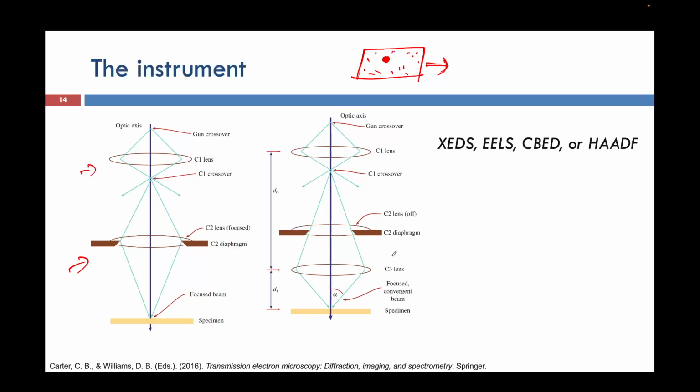And remember, here I have given one C3 lens. C3 means condenser 3 lens. It is not a condenser 3 lens, rather it is a combination, so this lens is called the CO lens. CO means condenser objective lens. In this scenario, the objective lens has been split into two parts. One will be in the condenser lens system, and another one will be in the objective lens system.